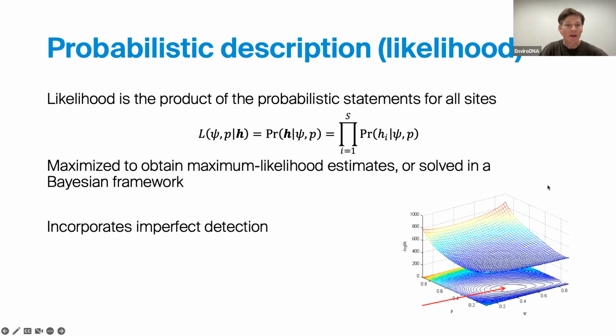And then you will solve the likelihood to arrive at some parameter estimates in either a maximum likelihood or a Bayesian framework, as we more commonly do.